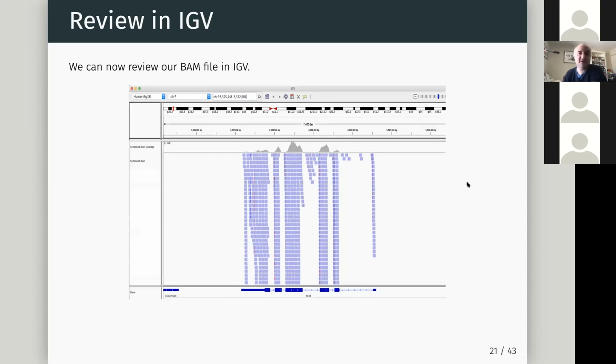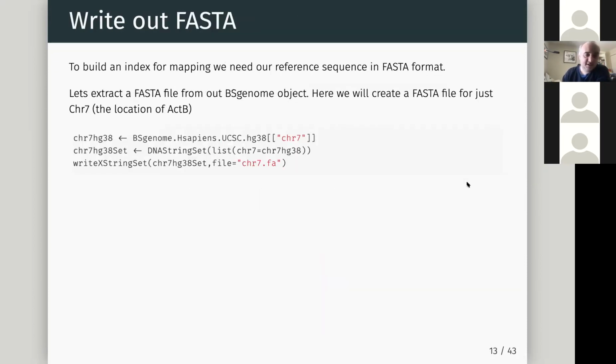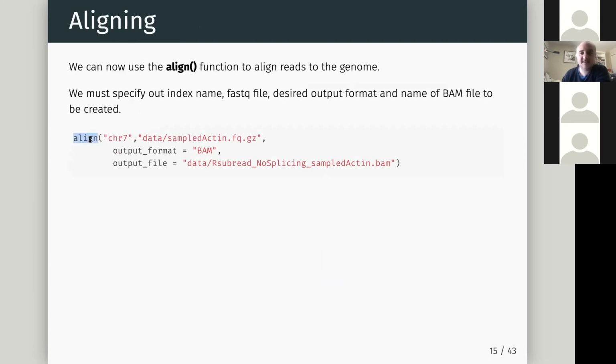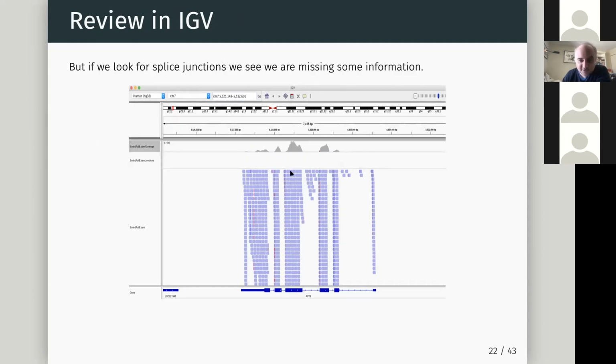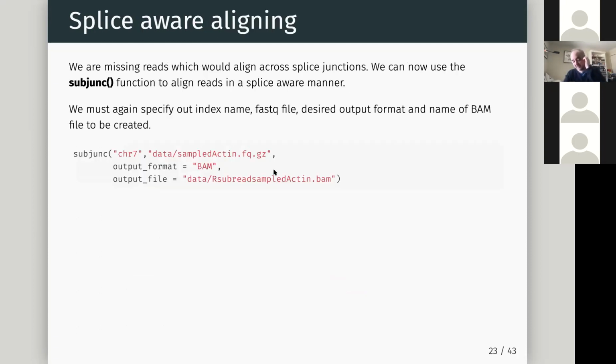Okay, and that's because, like when I said back here, we're going to do the align. This isn't a splice-aware aligner. So now I look at this and I try and find junctions. It's just not able to map these junction positions. It's not built for it. That said, if you read that paper I sent, we're only missing a small percentage of genes. And actually they do have methods to map these. They are still mapped. They're just not showing the splice junction, right? But we want that splice junction because we want to use this later on.